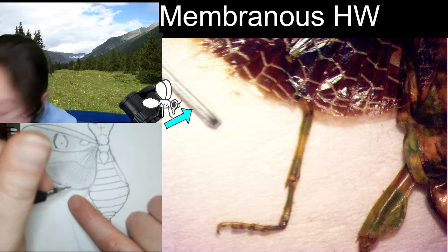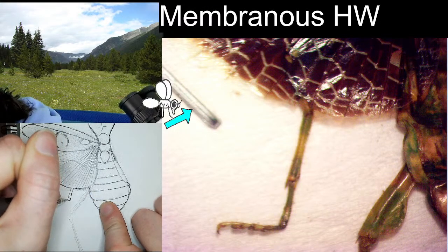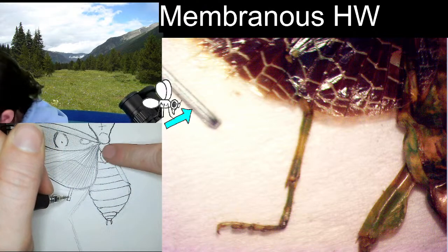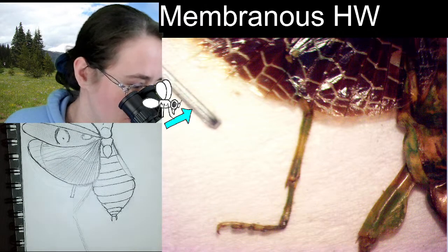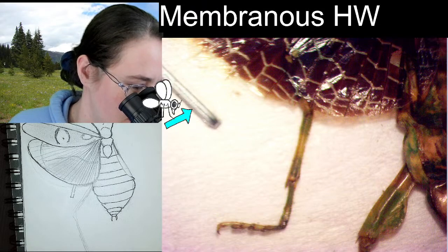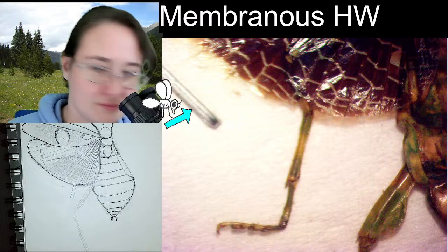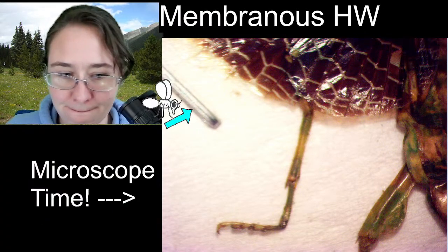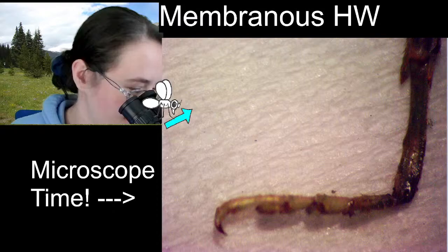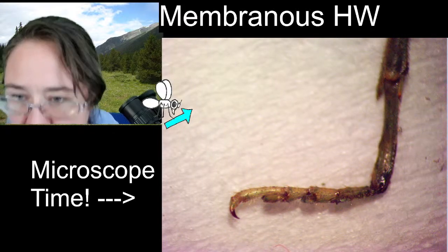Alright, so we have a nice thin tibia here. Comes out from that leg, comes up, down. That's where the tibia ends. And then we have these tarsal segments. There is 1, 2, 3, 4, 5, possibly 6. We're going to zoom in. One, two, three, four.